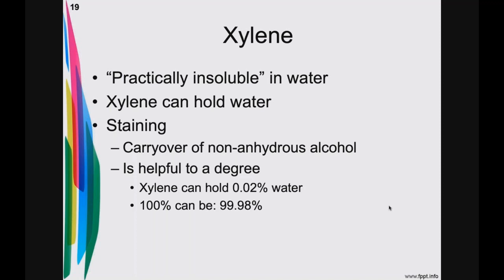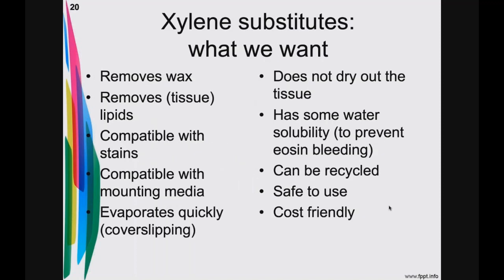So we have our xylene. We know it can hold water, and that's an advantage. If you do some calculations, xylene can hold 0.02% water. It may not seem like a lot, but let me tell you, when you have humidity in the air, we are enjoying that we can use not 100%, but 99.98%.